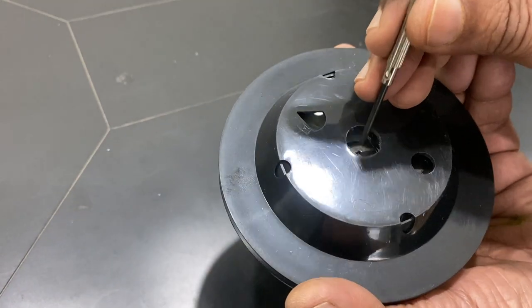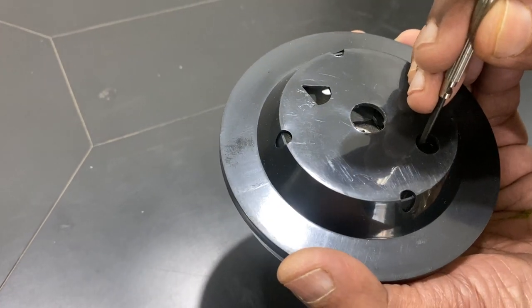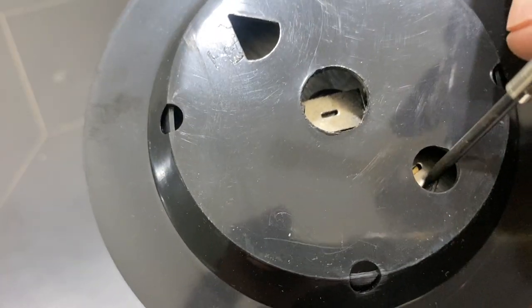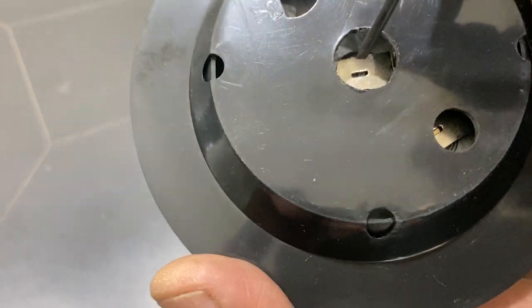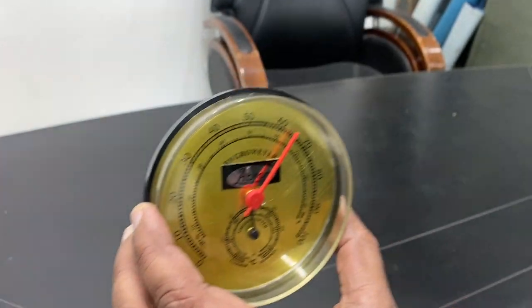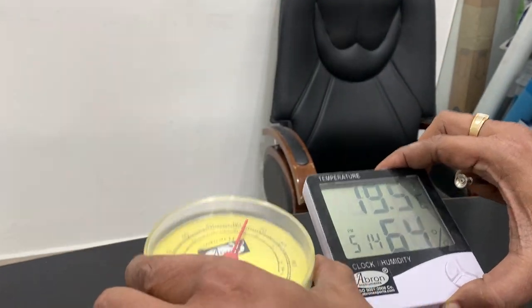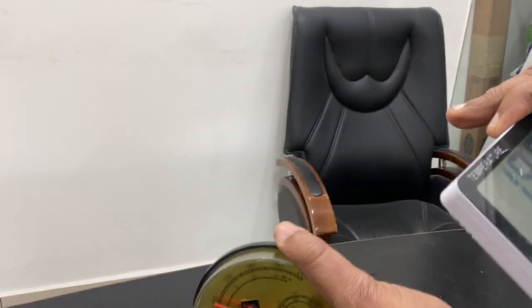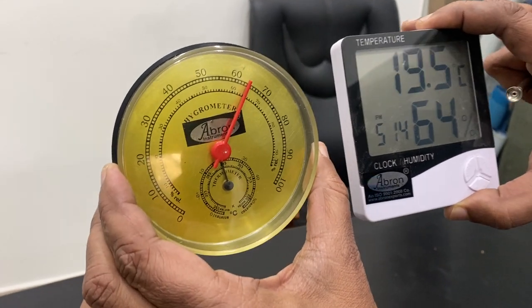There is one notch here for humidity adjustment and another one for temperature. You can see the notch inside — you can change it with the movement. When you have to calibrate it, keep it in the vertical position, not horizontal, because the temperature scale and humidity scale can both change due to movement.